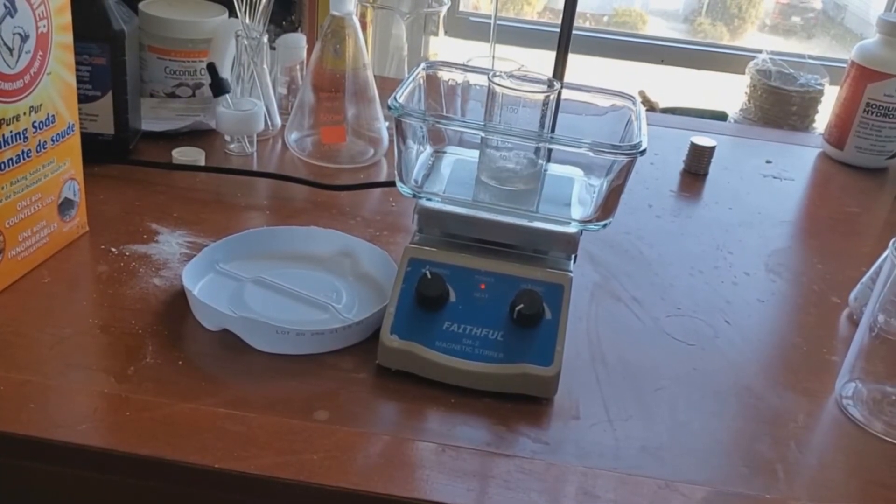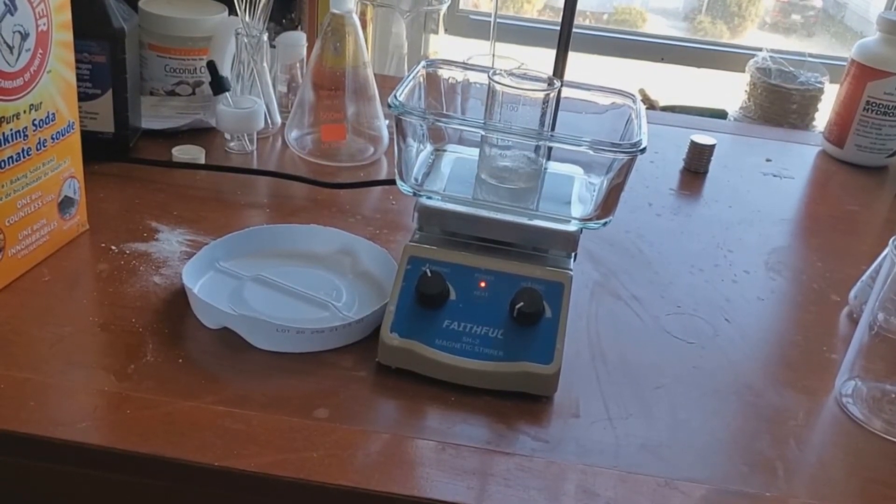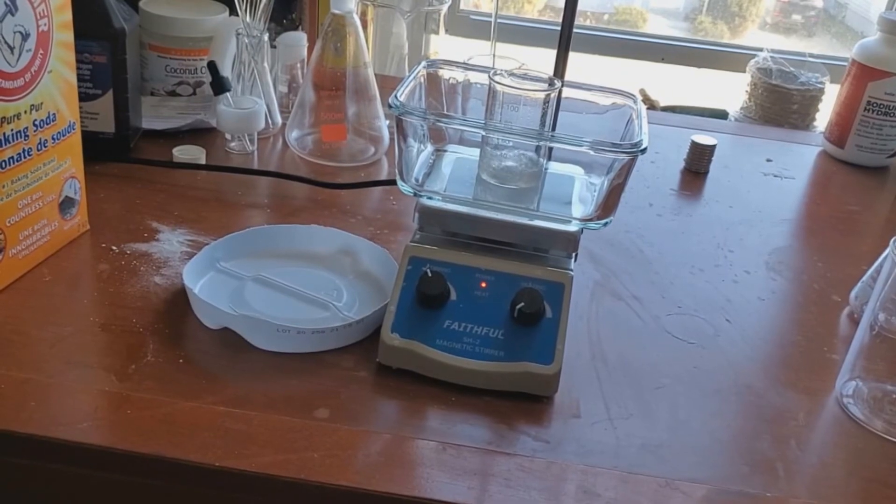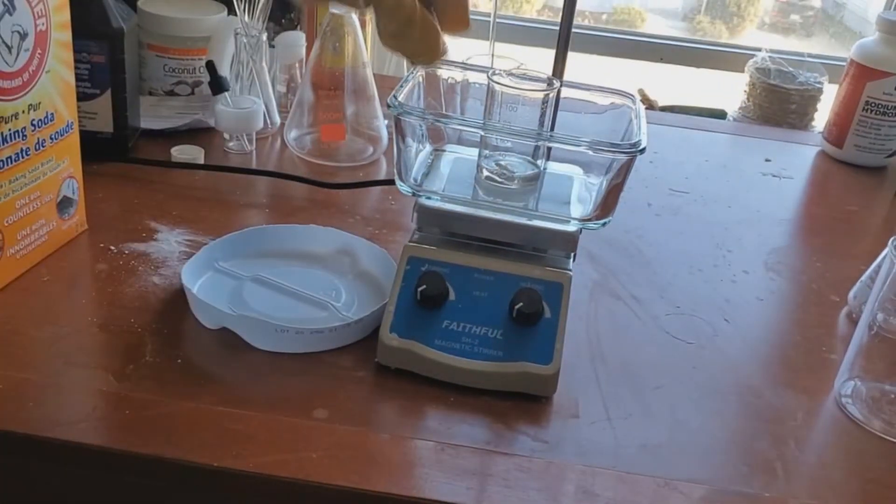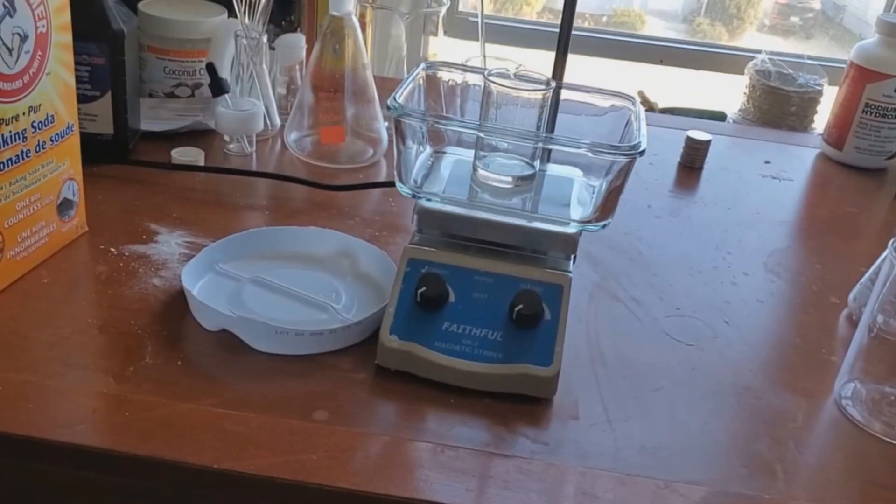Piranha solution is typically not stored, and it's made and then used right away, because it is a super strong acid and one of the strongest oxidizers. It reacts quickly with organic material, and because of that, it is used in labs to clean glassware and stubborn oxidizers that won't come out.